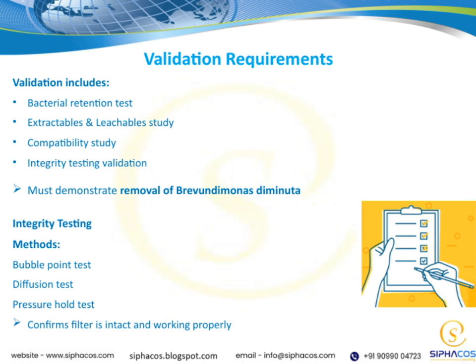Then, there's the compatibility study. This test verifies that the filter materials are compatible with the fluids or products they will contact, preventing any adverse reactions. Finally, we perform integrity testing validation, which is vital to confirm that the filter remains intact and functional throughout its use. Now, the key point here is that the filter must demonstrate the ability to remove Brevundimonas diminuta effectively, as this microorganism is often used as a worst-case challenge in validation.